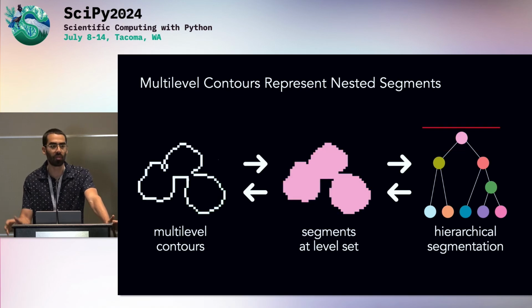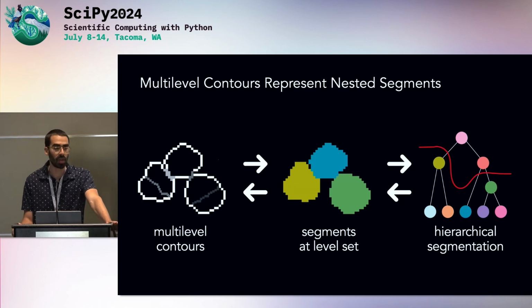So if you're familiar with hierarchical clustering in normal data science, not images, this is kind of doing a horizontal cut in the dendrogram, which can be naive most of the time, because often the ideal result is not from a simple horizontal cut.